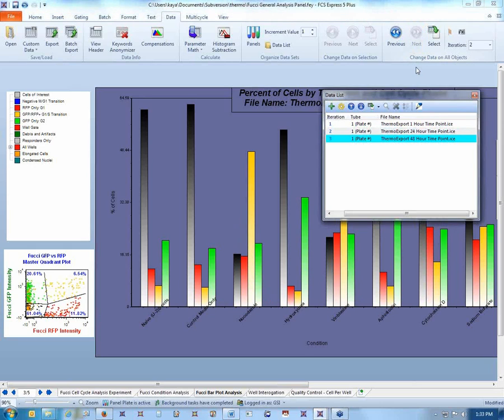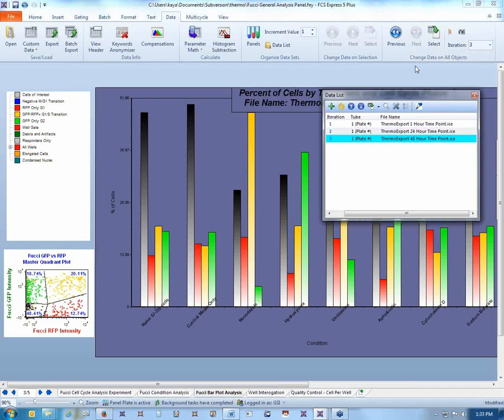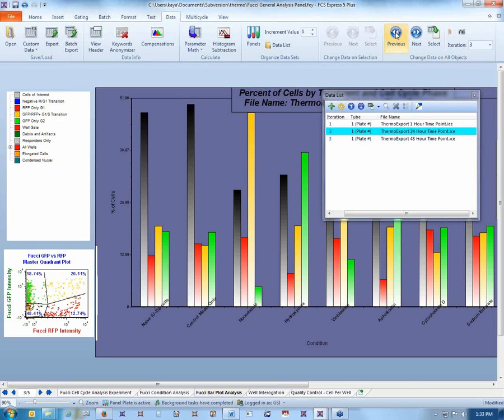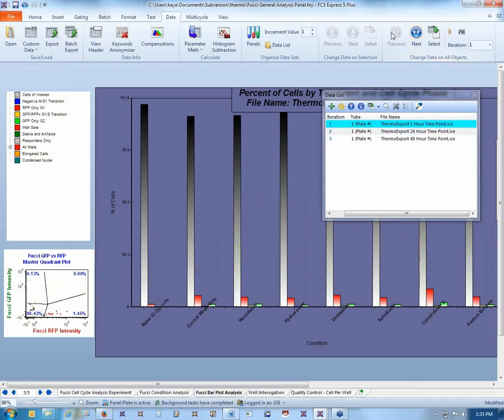So you see, if you were doing this in another program, you would probably be creating your analysis over and over again to some extent for every time point. And here it's as easy as the click of a button to just summarize your entire experiment. Okay, so let's do this. Remember I said that I would like to show you a batch process. So I think this is an interesting layout to show you that.